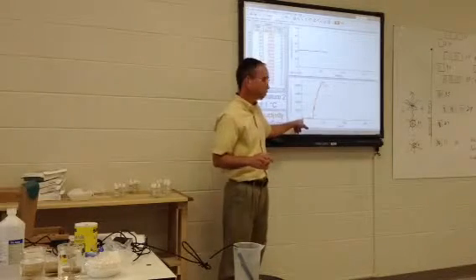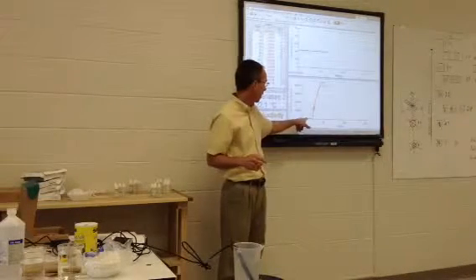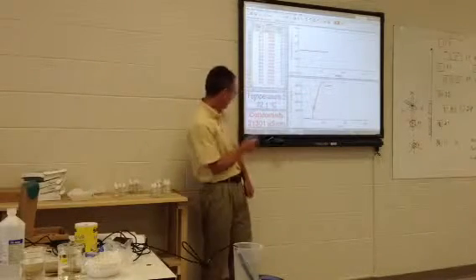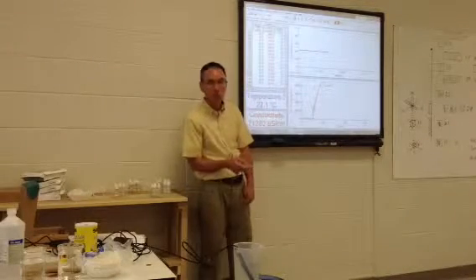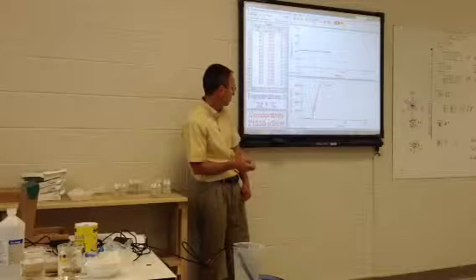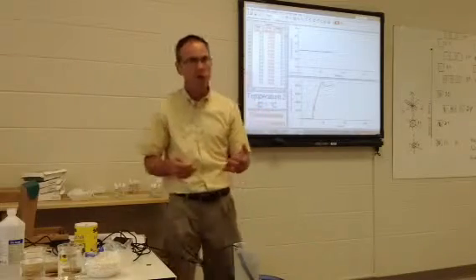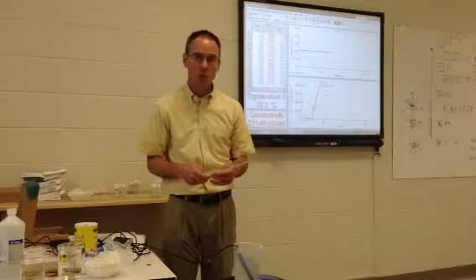This is before I added the salt. Okay, it was flatlining at about 550 microsiemens. Then I added the salt. Now it's up over 21,000 microsiemens per centimeter, okay, because of those ions in solution. So that's a good illustration of how good of a solvent water is.